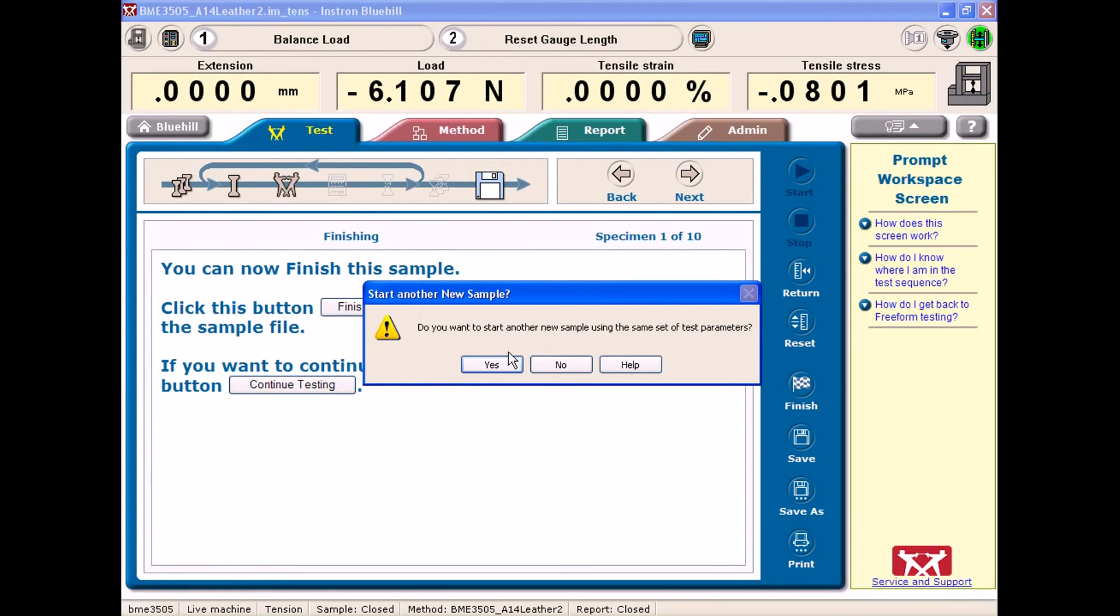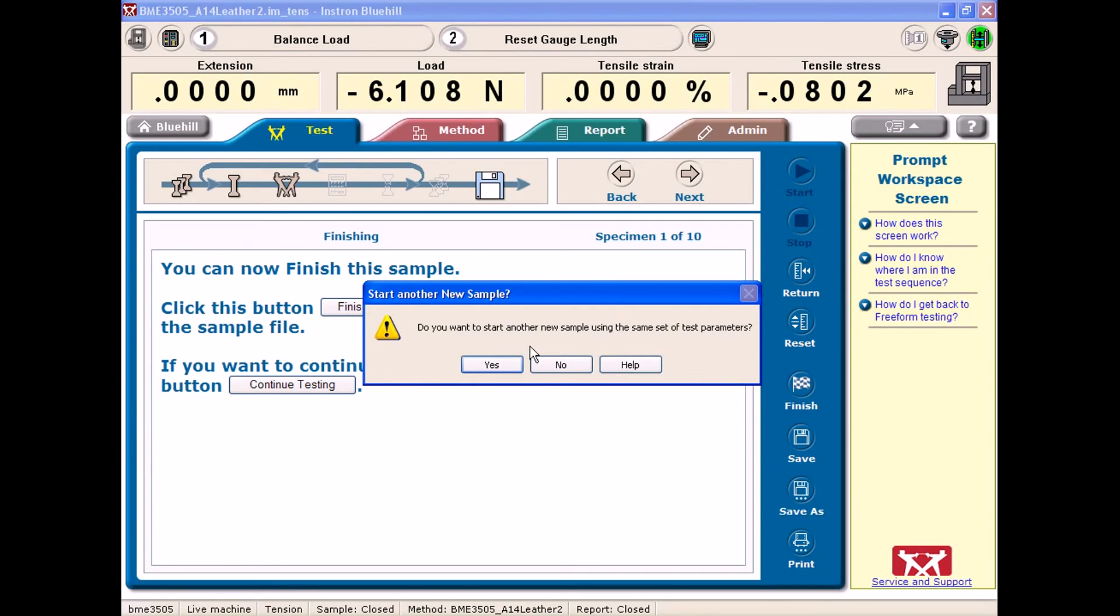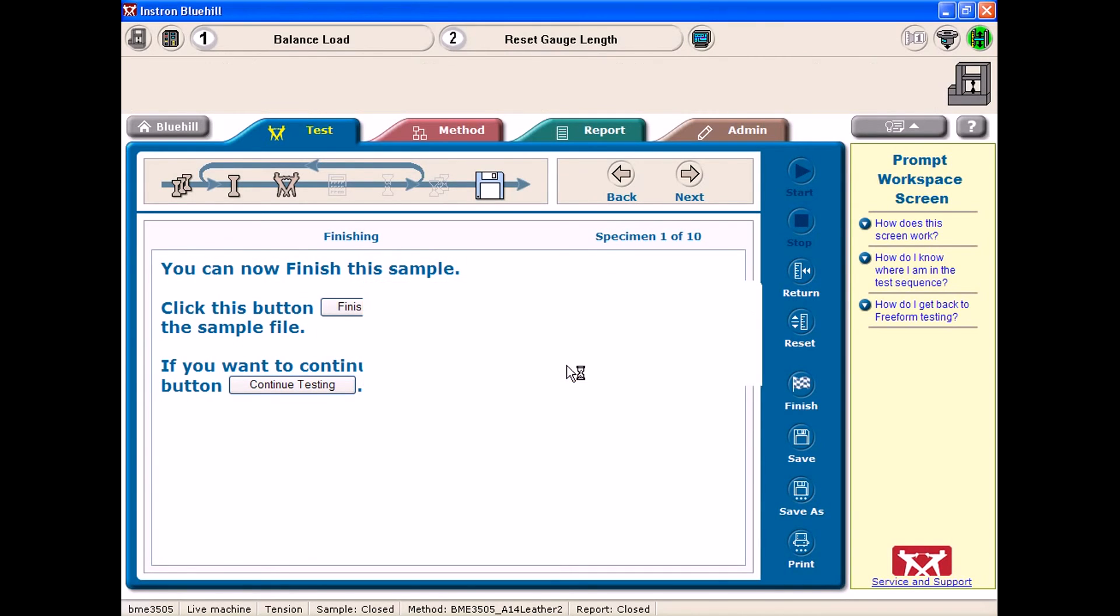And you would be prompted if you wanted to run a new sample using the same set of test parameters. So if you're looking to change and do a different, say, leather strap, you could do so by hitting yes. But I'm not going to do that for this example.